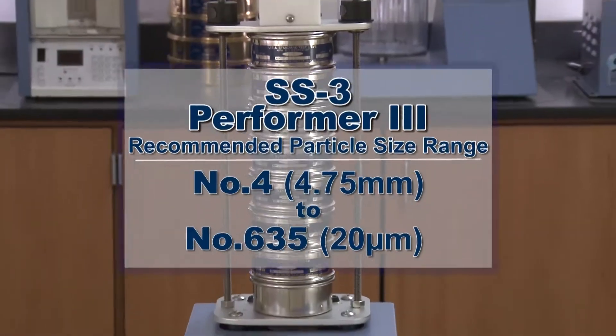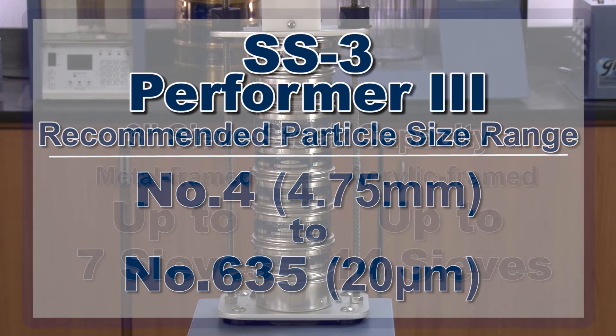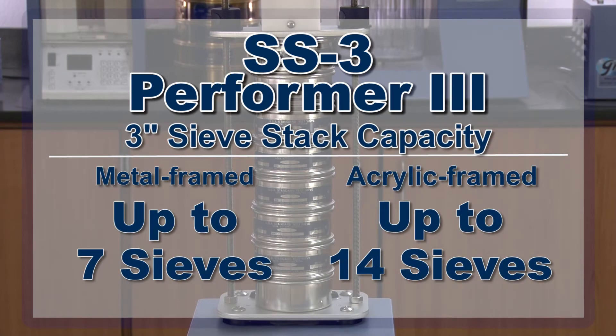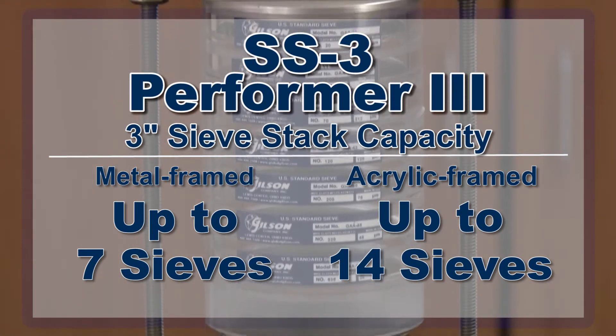With a recommended particle size range from number 4 to number 635, the SS3 can hold up to 7 full height metal frame sieves plus a pan, or up to 14 acrylic frame sieves plus a pan.